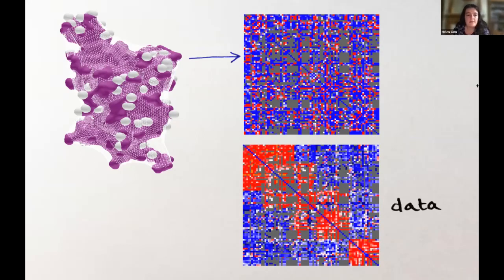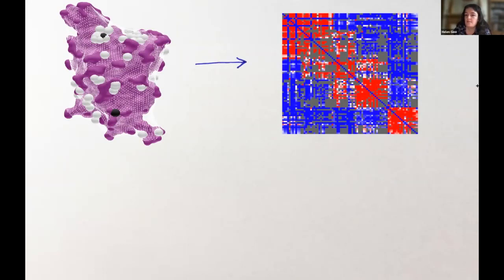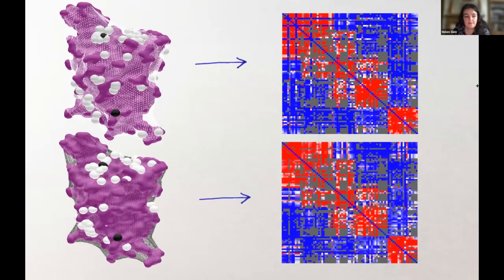And so once we do that, we can generate solutions. And if you do this multiple times, you actually end up with different kinds of solutions. So what you can see is that we end up with one kind of antibody set, which produces a really decent prediction of the antibody positions. And you can produce several different kinds where the antibodies are actually in completely different places.